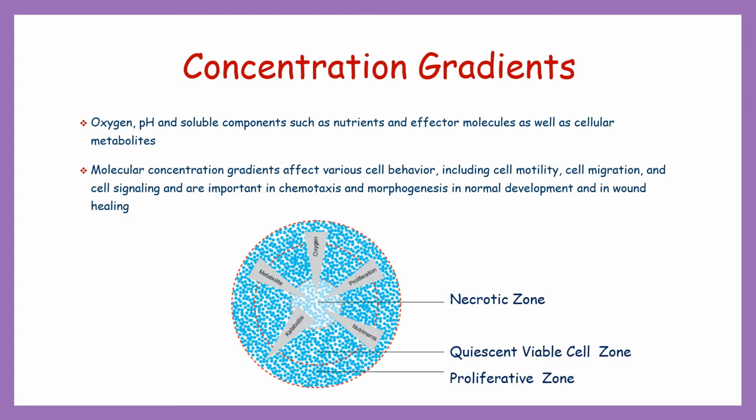If we talk about tumors, 3D tumor spheroids are much more representative of in vivo tumors. There is a peripheral layer of proliferative cells due to the closeness to the supply of oxygen and nutrients, underlaid by an intermediate layer having quiescent cells and an inner necrotic core. This sphere can mimic inward diffusion to form oxygen and nutrient gradients, and is a perfect model for in and outward diffusion of regulatory molecules and provides a reservoir for the accumulation of waste.